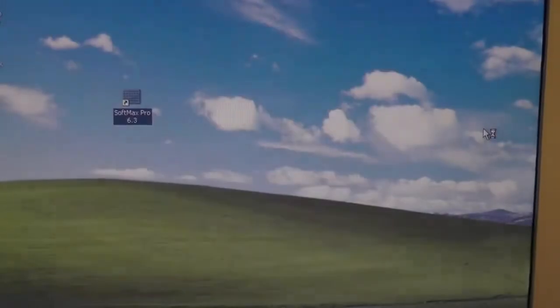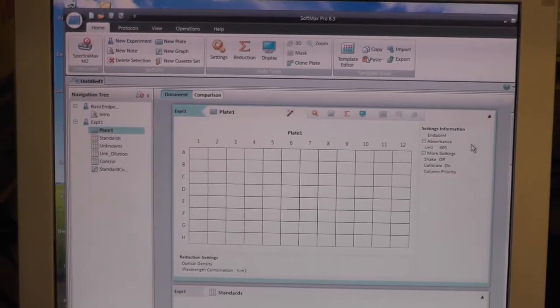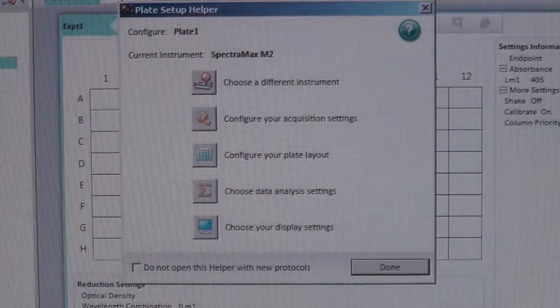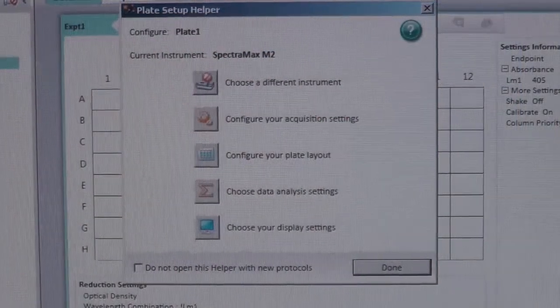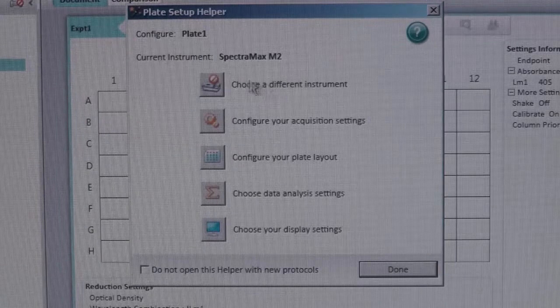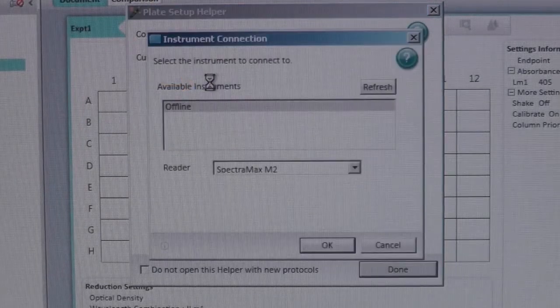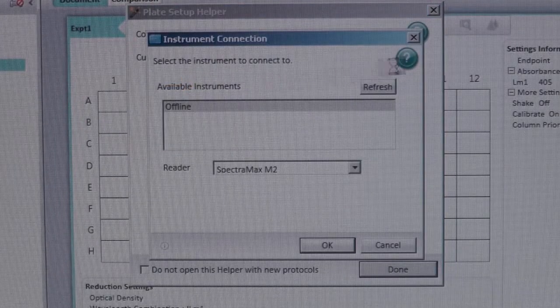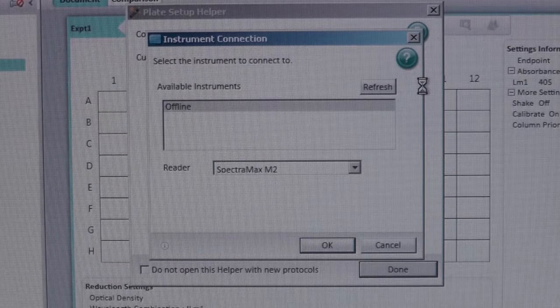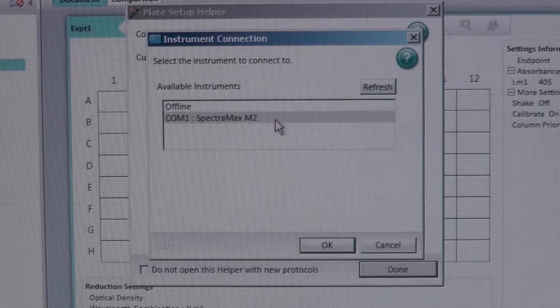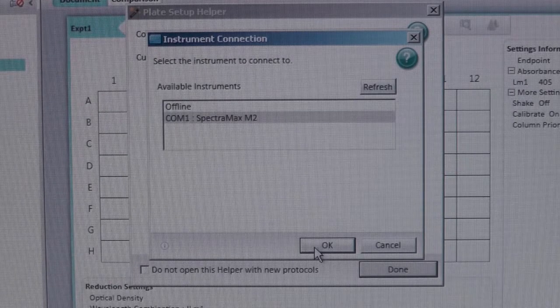Then double click to open the Softmax Pro program on the computer. A pop-up screen will automatically appear. First select the Choose Different Instrument icon. Make sure to refresh until the name of the machine appears. Then click OK.